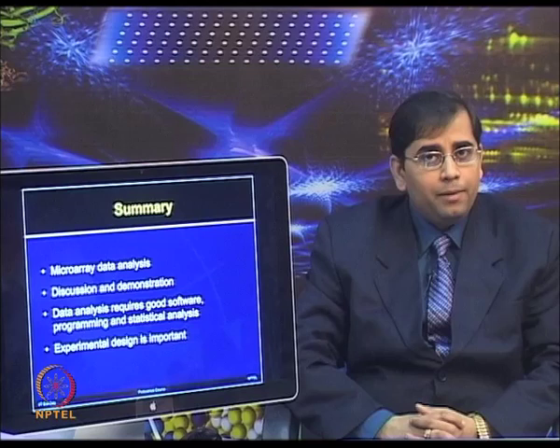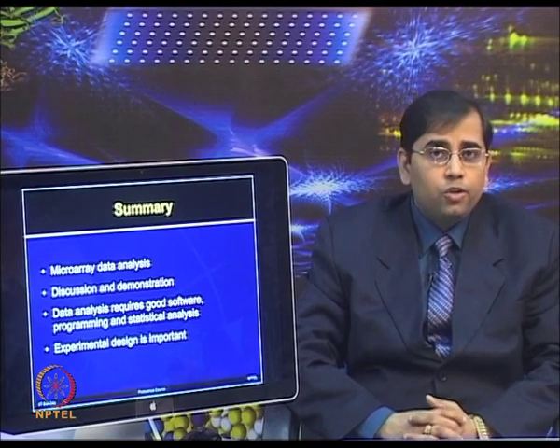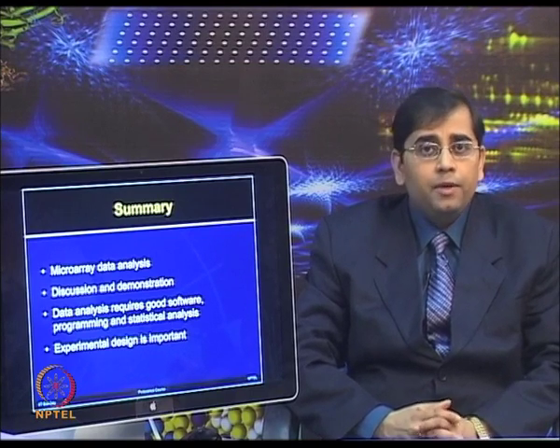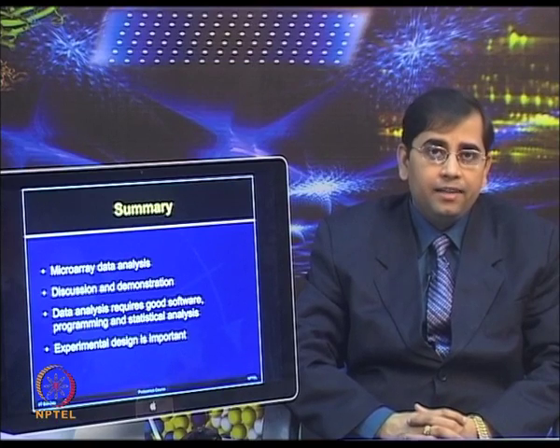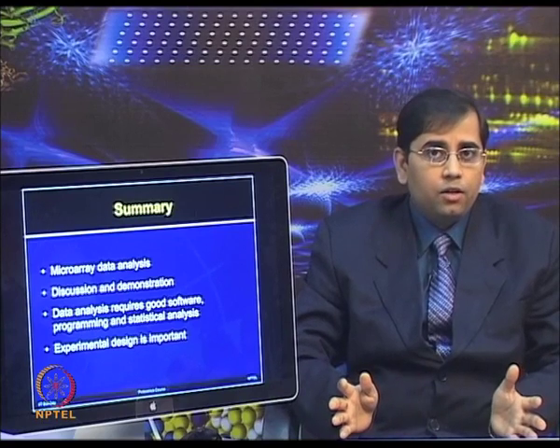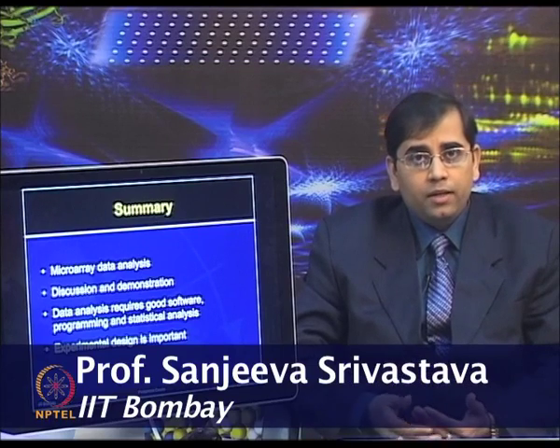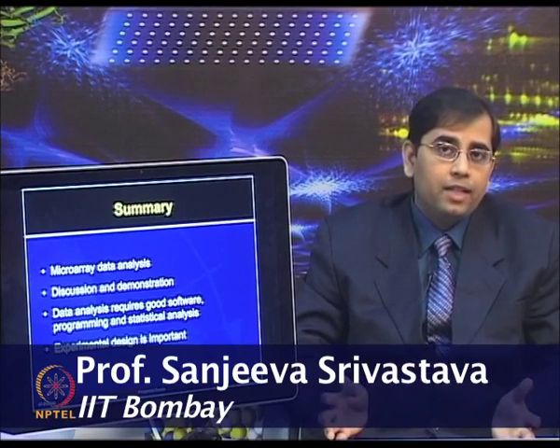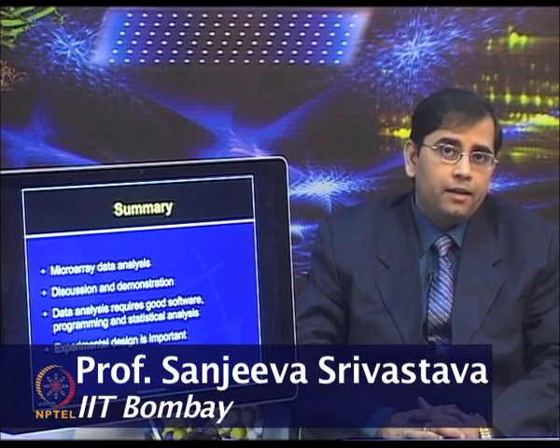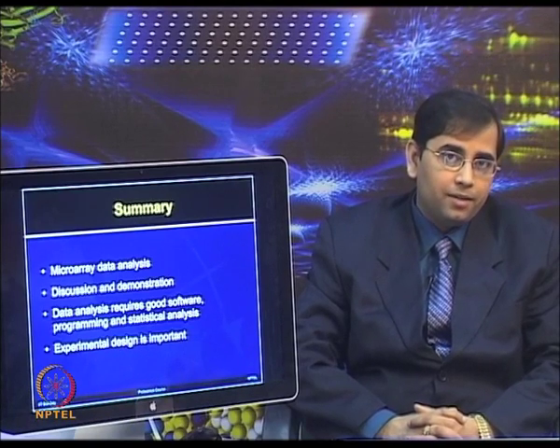So, microarray experiments generate high throughput data. They provide you thousands of features of information in a very short time, but it becomes very challenging to analyze that data, especially when you have to compare various slides from different experiments, and you have to normalize and treat them equally, so that you can compare all the slides on the same platform. So careful image processing and data analysis becomes very crucial in microarray based experiments.